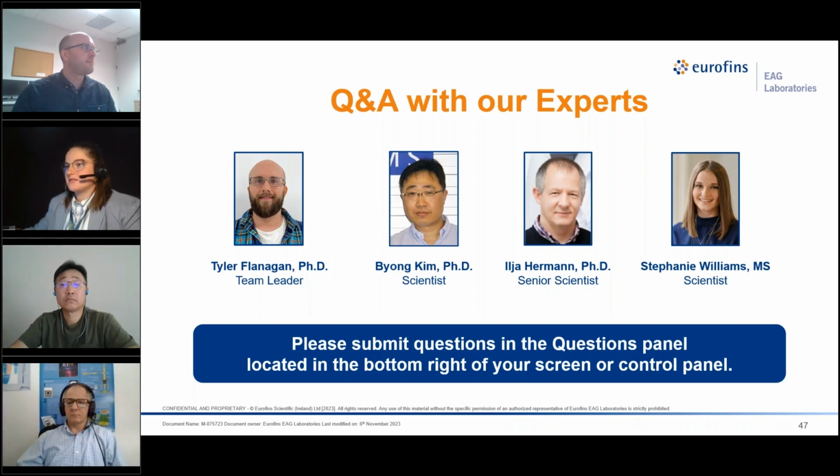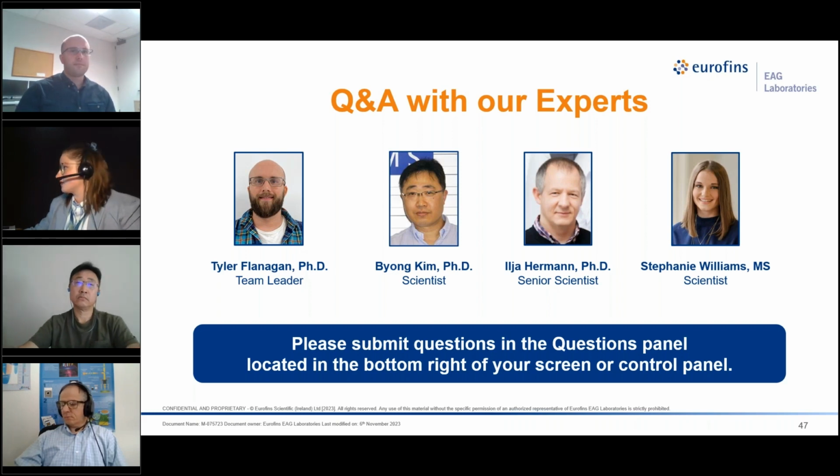Okay, so please feel free to keep putting questions into the Q&A section, but we're going to get right into this. So first, I have a question for Ilya. This was brought up when you were on slide 25. It said, what is a technique that can be used for measuring the film adhesion to the substrate?